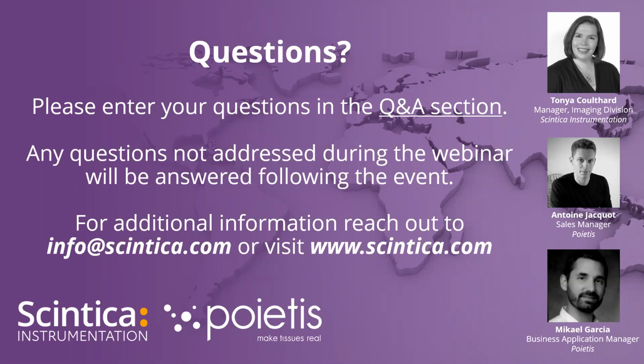Perfect. Sticking on the topic of the laser, another question: is there any effect such as heat on the cells caused by the laser hitting the metallized substrate on the slide, which the cells are placed onto?